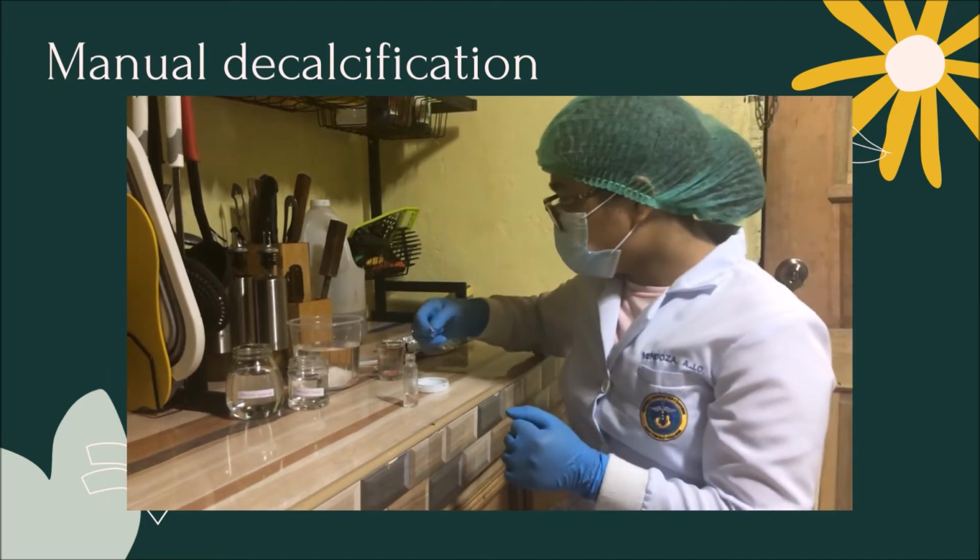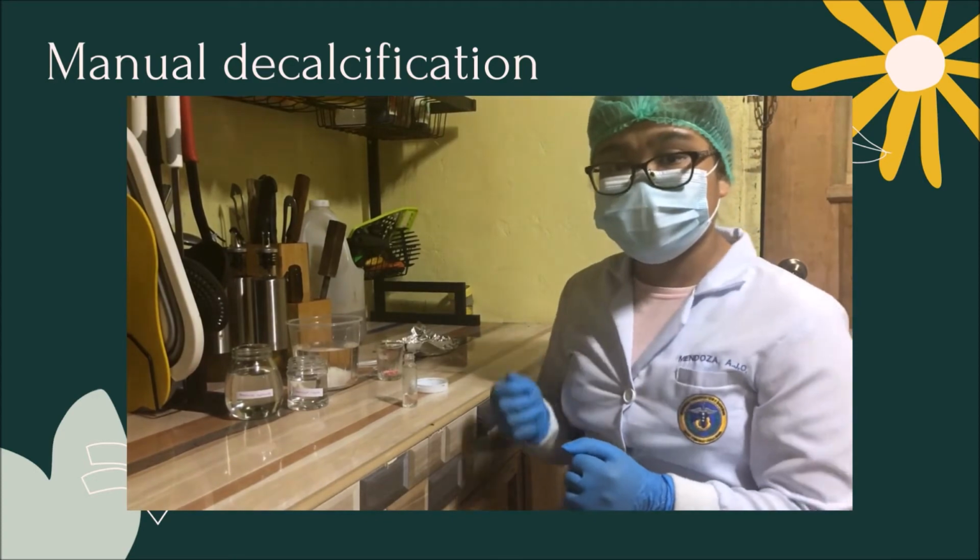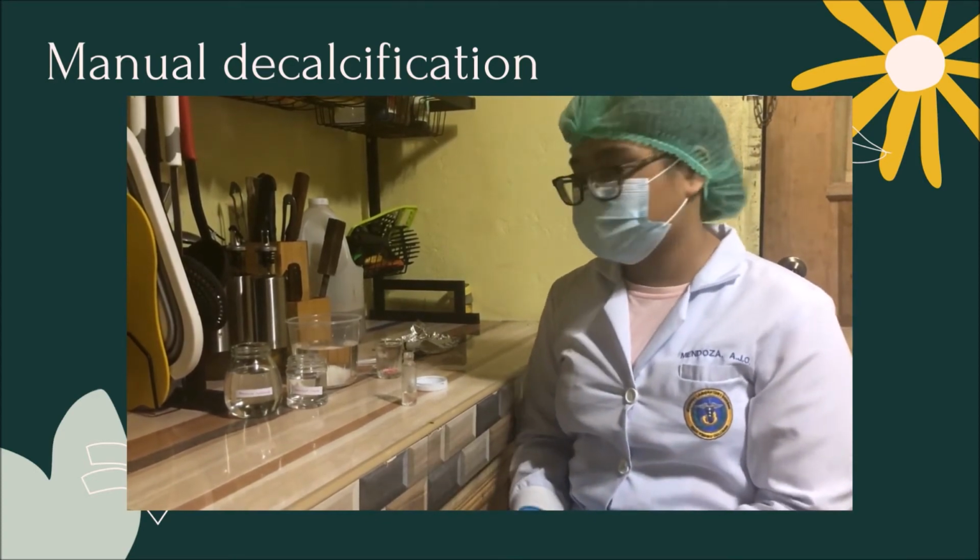Now, since we can observe that the pH is now neutral, we can add 5 ml of saturated ammonium oxalate to the solution.